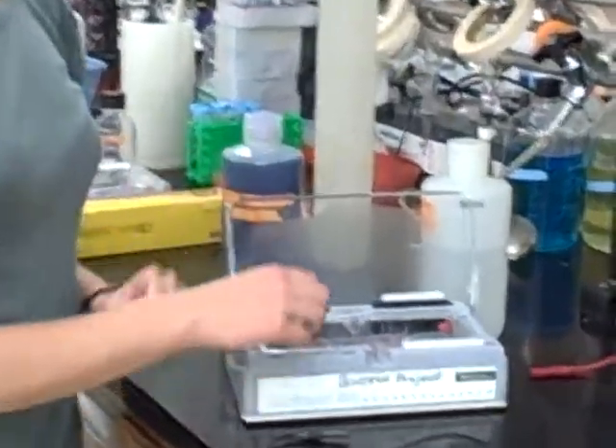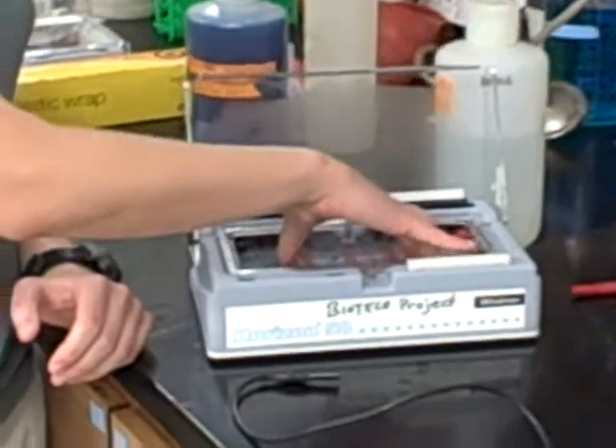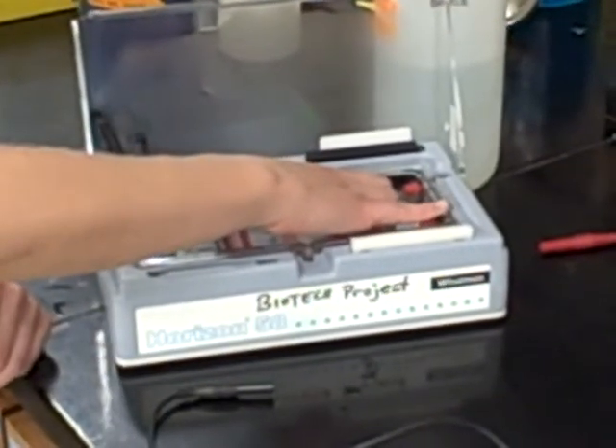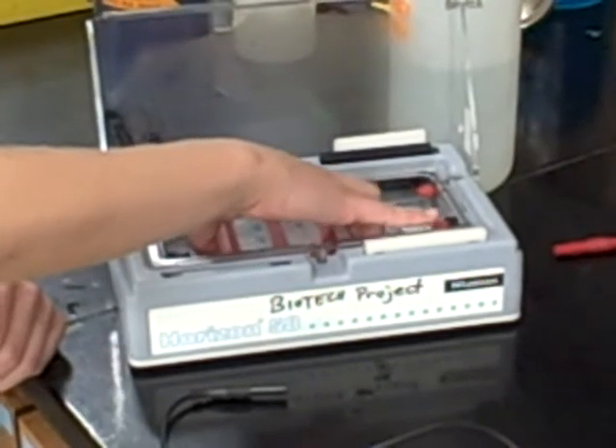Open the gel box and remove both the gel and the cast. Be careful when doing this because your gel is both fragile and slippery.